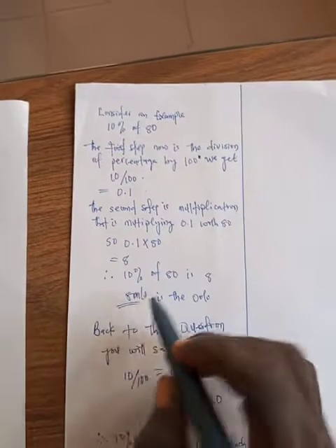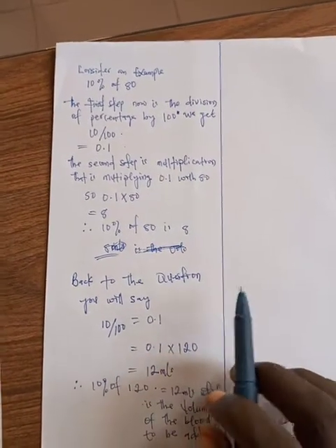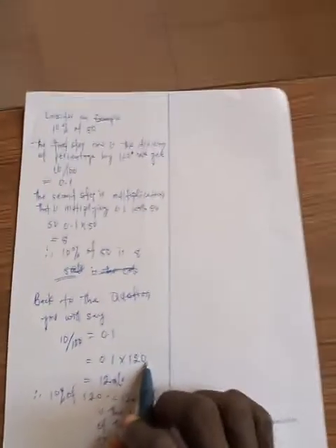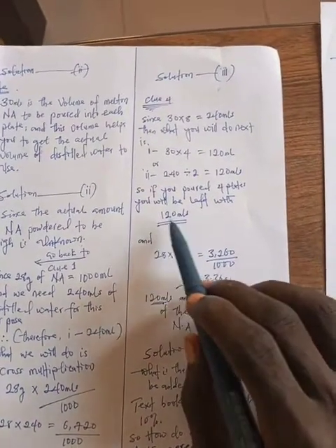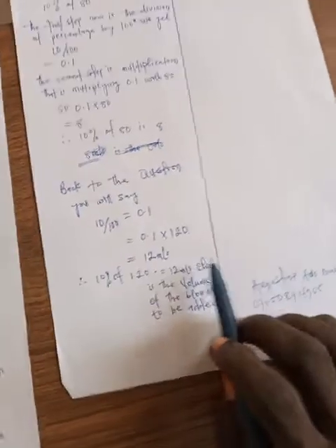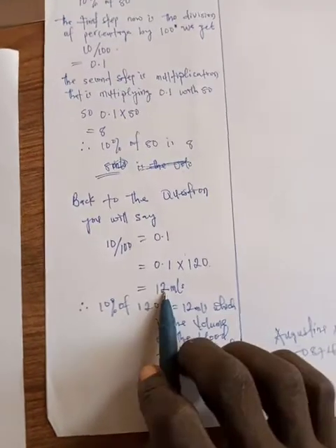So forget about these 8 mils. It's not supposed to be here. So back to the question now. You say 10 divided by 100, which is equal to 0.1. So 0.1 times 120, since if you pour 4 plates of nutrient agar, you will be left with 120 mils left to prepare your blood agar. So what you are supposed to do next is that you say 0.1 times 120. So you will have the value of 12 here.